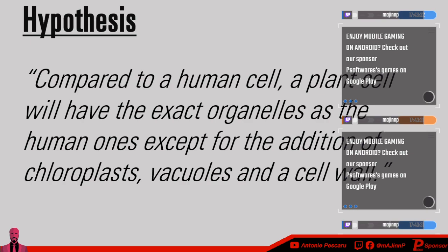The cell wall, like I've explained, is a wall that surrounds the cell, that surrounds the membrane, making sure that the cell remains in place. You saw it a little bit on the first page of the presentation, but I'll show it later on if I can with my mouse, because I am currently on a computer right now.